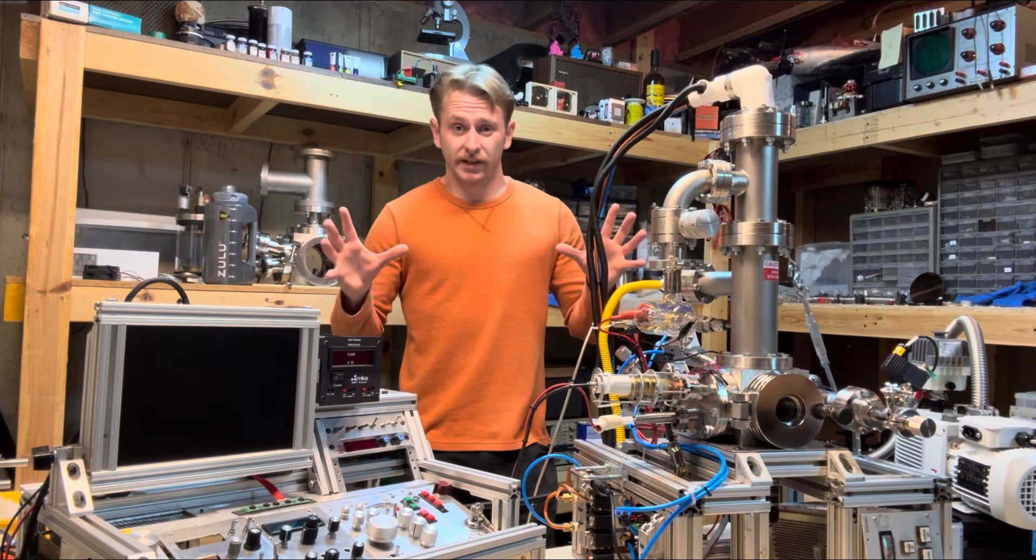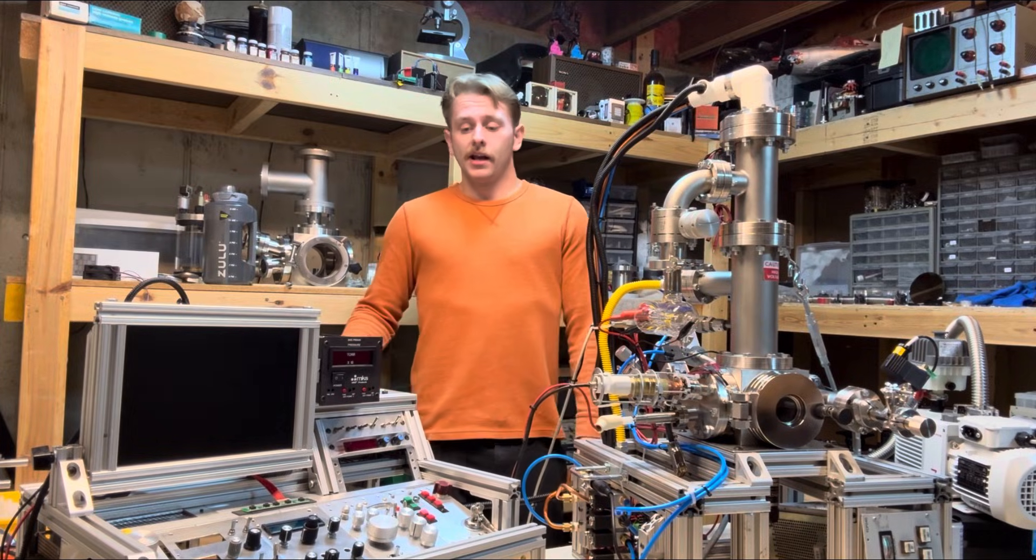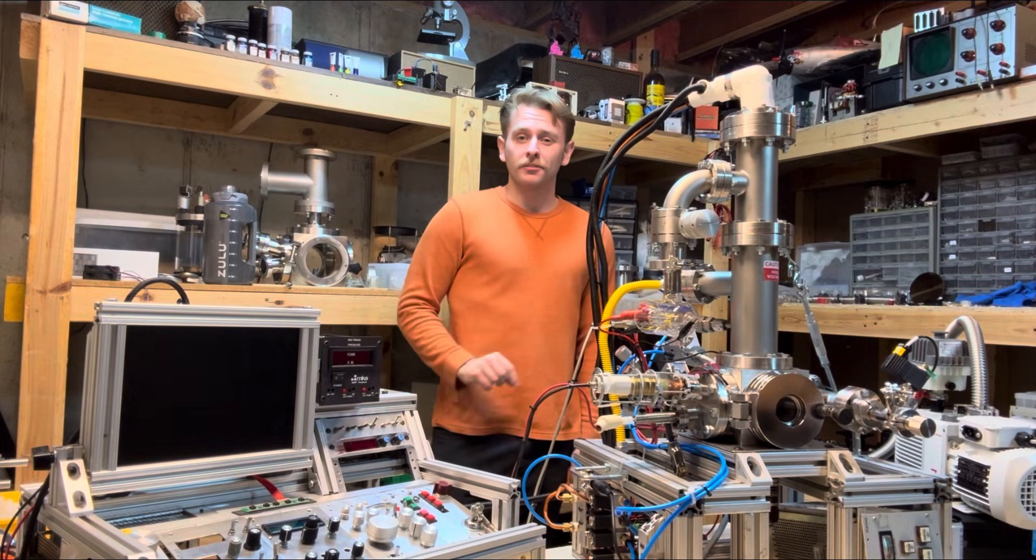Four months ago I started putting this big contraption together. This is a scanning electron microscope and I've been wanting to build this thing forever.